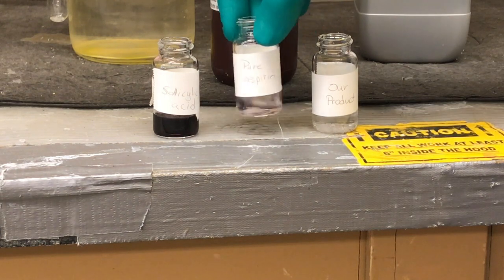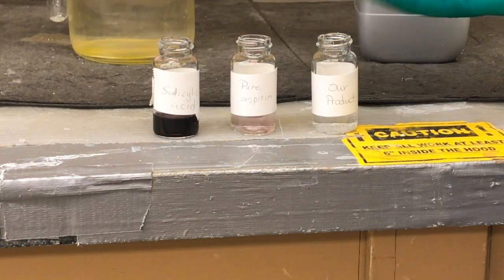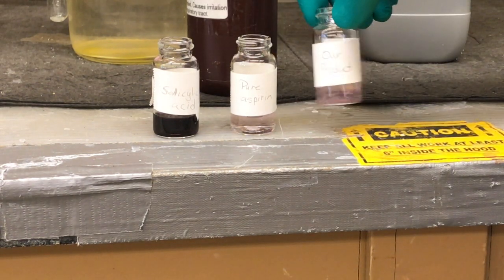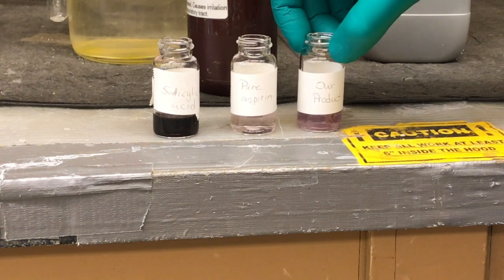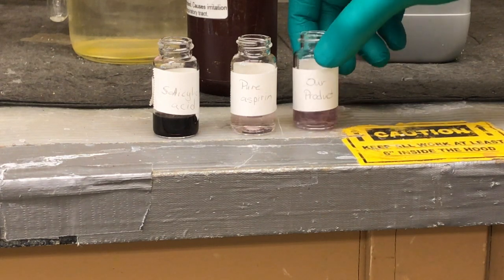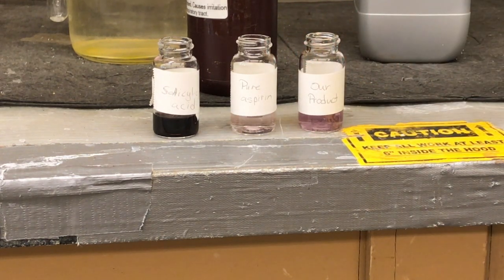We do not see a vibrant color change for the pure aspirin. And we see a minor color change for our product. So what this probably means is that our reaction did not go fully to completion. And we could validate this with the melting point and IR.